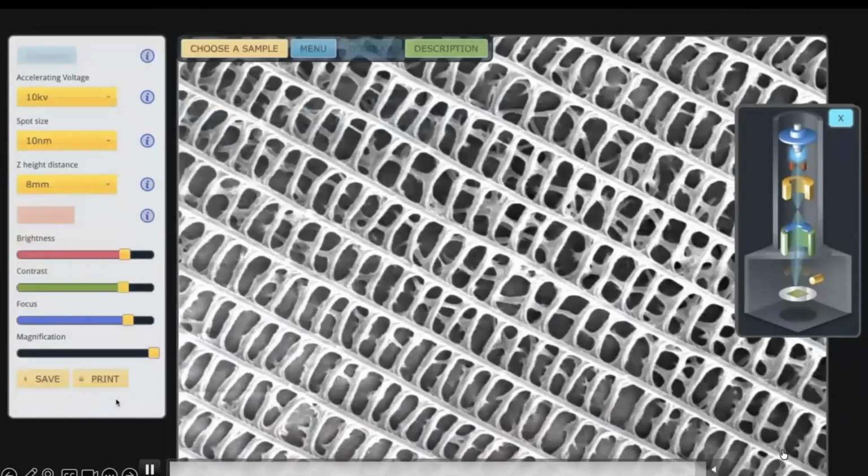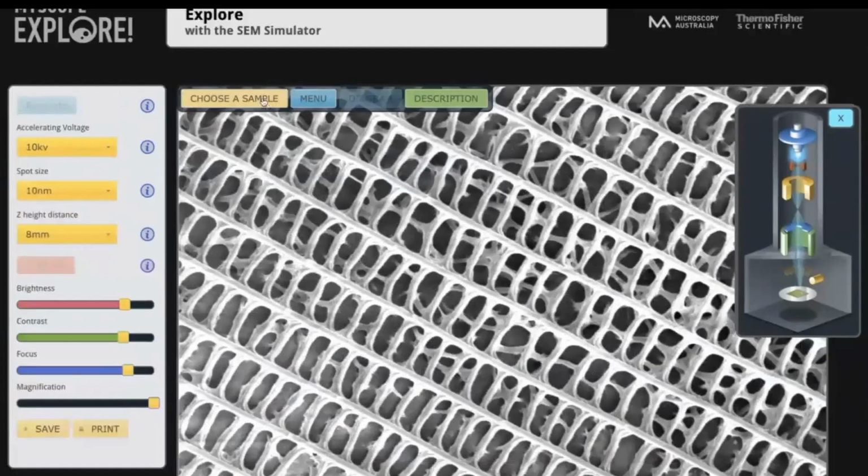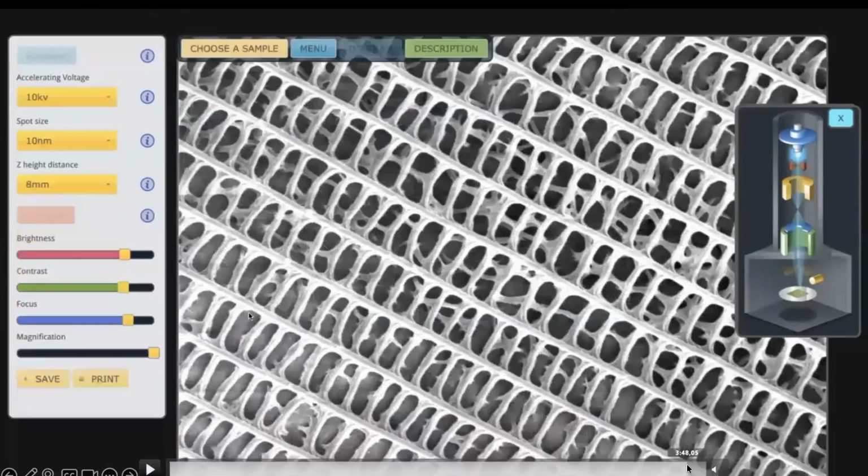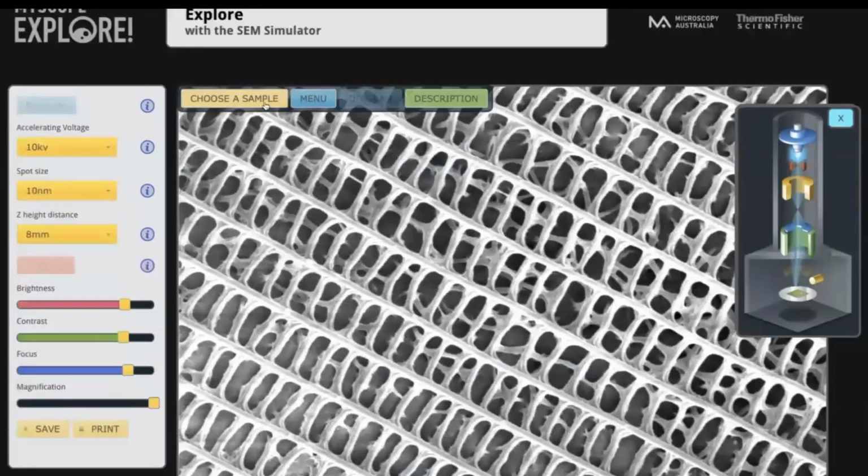If you increase the magnification, you start to see more details and further details. Now you start to see more stripes, and then you start to see even more the nanoscale structures. So the butterfly wing is an example of a structure which goes from macro to micro to nano level. It's a hierarchically assembled or structured material. And these are the structures of a butterfly wing that you see.